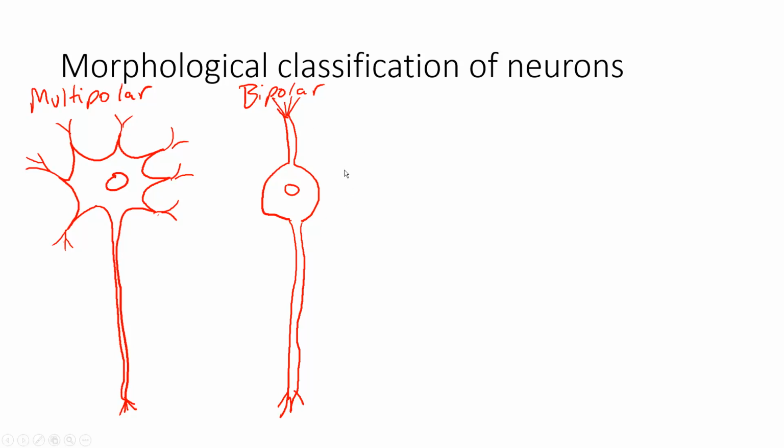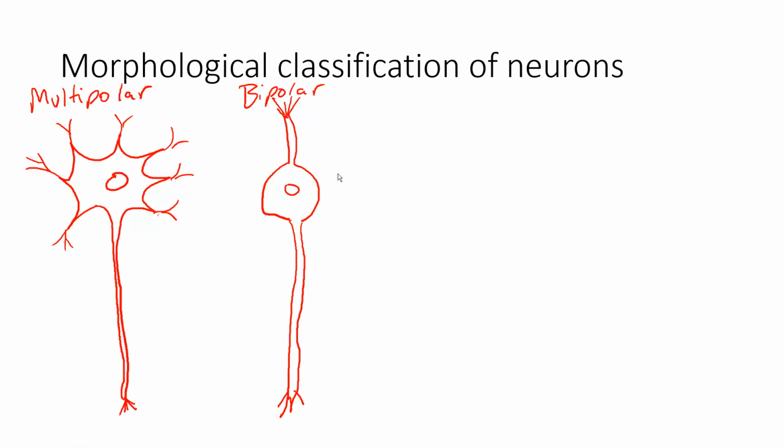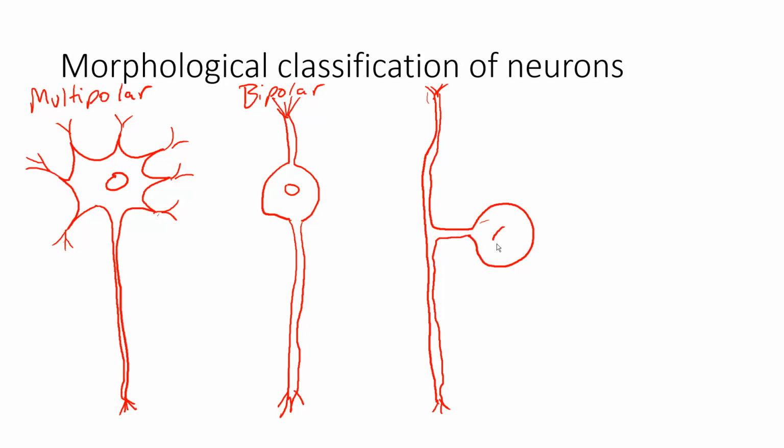And then finally, another slightly more common, but not as common as multipolar cells, are cells in which we have a single dendrite going into a single axon, like so, and the cell body, soma, perikaryon, whatever you want to call it, sits off to the side. So there's our axon terminus there. Here's the dendritic fibers coming in, and then here's our soma off to the side. There's the nucleus. So this neuron, we only have a single pole attached to the soma.